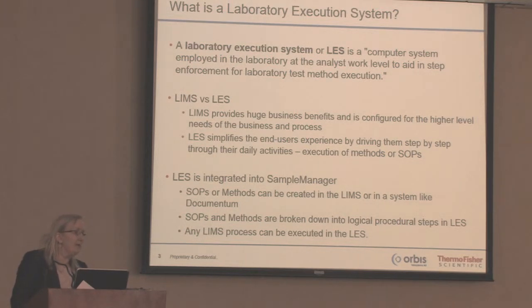The LES is separate to the LIMS, but they tie in together, so you can link from the LES to the LIMS, so that you open up the LES from the LIMS, you execute your method, it goes to SampleManager, gets all the results. You can enter data into the LES from SampleManager, and then from the LES back into SampleManager.